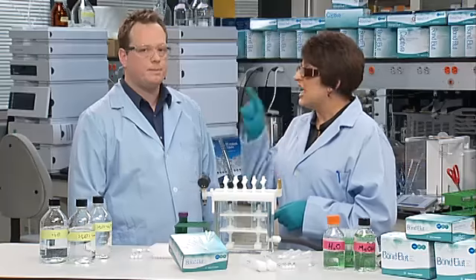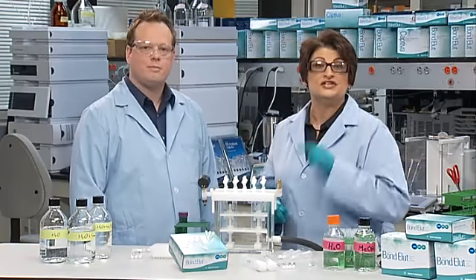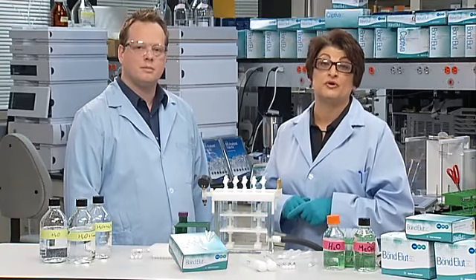Conditioning is important because the SPE cartridge is packed with dry material, and for this material to be active and effective, it must be exposed to organic solvents. This process is very similar, but not identical, to what is required for a new HPLC column. Absolutely. Conditioning is essential for the column to perform correctly.